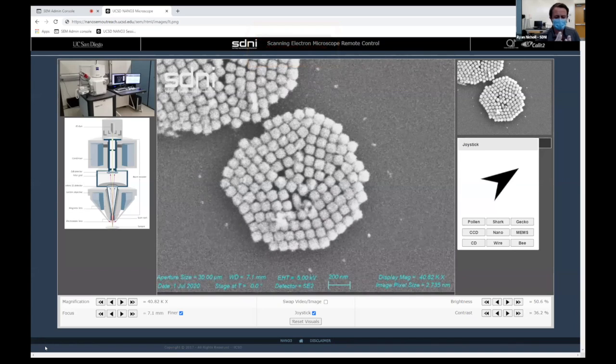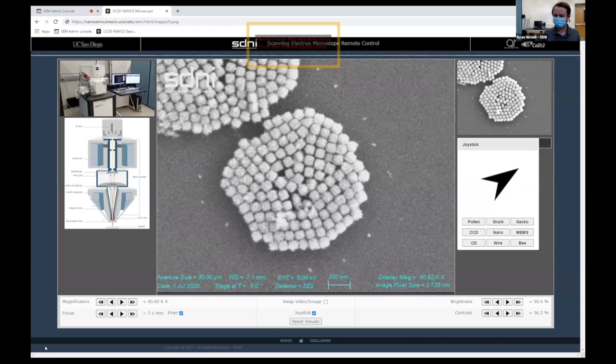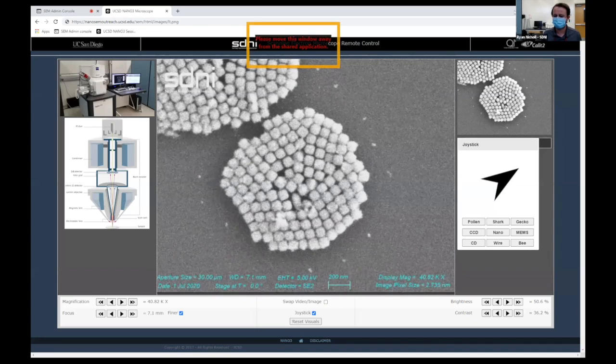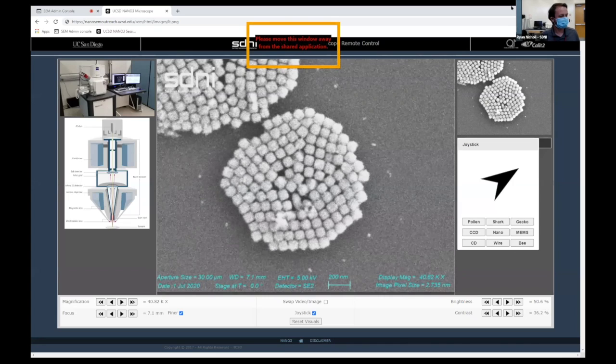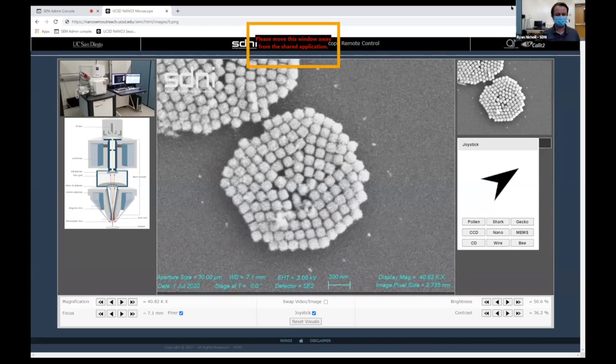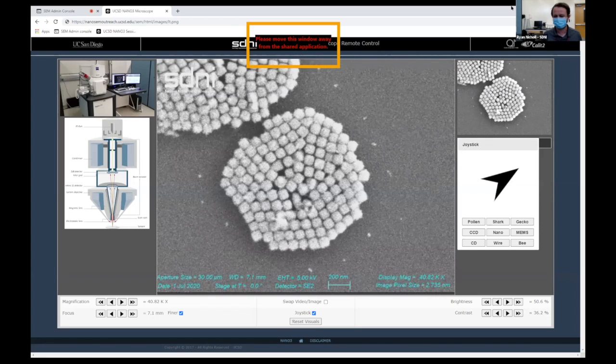We're using one wavelength of electrons. There is no dispersion. There is no color of electrons, right? But white light is a mixture of all colors. The electron beam that we're radiating onto the sample is basically one color. And what we're seeing, in fact, I just realized I should scan a cleaner image for you.